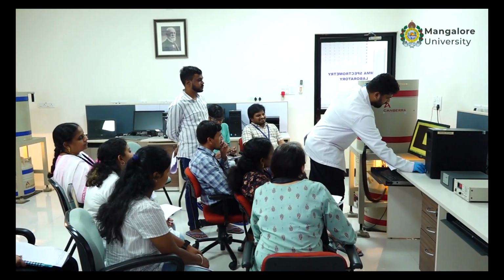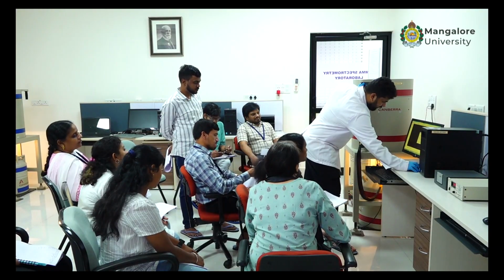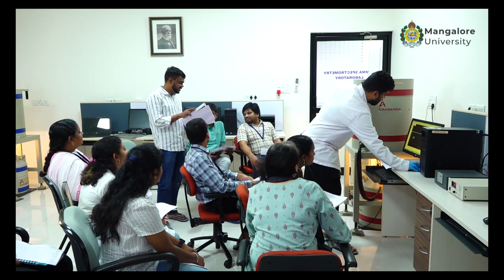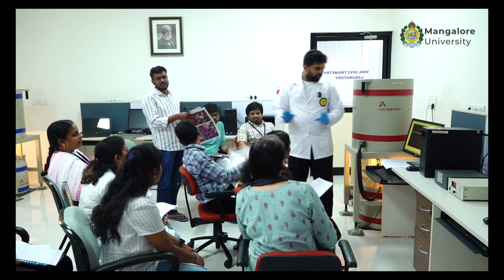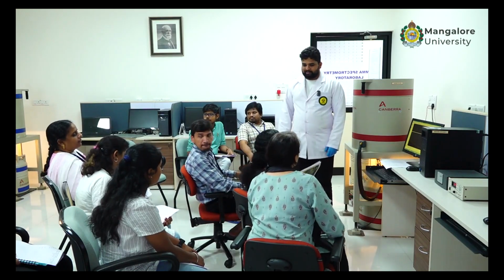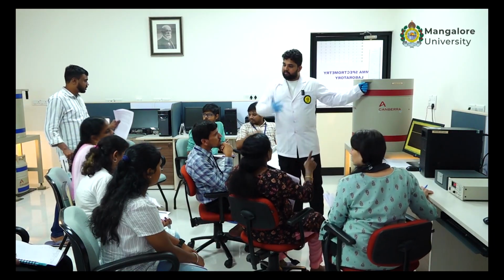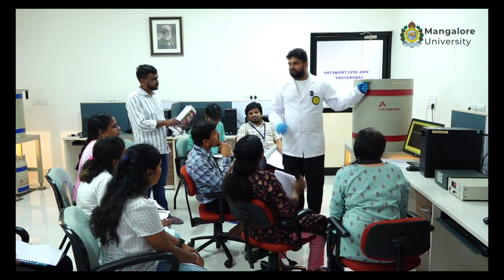So now I will open the file, compare. Yes, so display, clear, ROI, clear all. So all the background, everything I have cleared. The sample is counted for 60,000 seconds. It's up to you. Okay. And the counting is going on in the background after this? Yeah, counting is going on. We can even shut down the PC and go home while the counting is going on. It will not affect it.